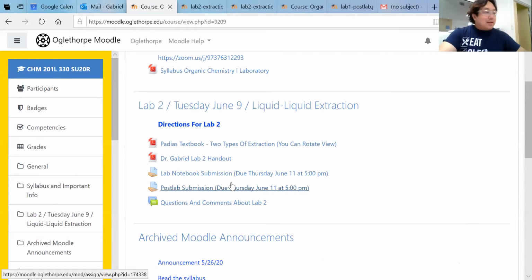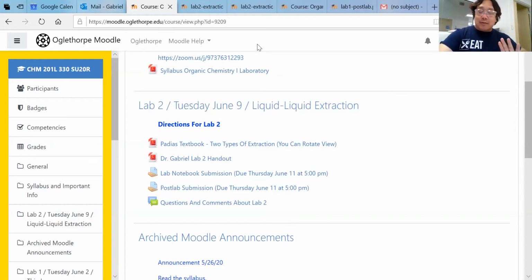Okay. Let me get to the setup and show you or demonstrate how to do an extraction. Again, you are taking observational notes, but you can definitely pause the video or rewind it. When I grade your lab notebook submission, I am looking for the pre-lab entry and your observational notes. How detailed are you? Let me give you an example. Something looks like water, okay? You could describe that as a clear liquid, okay? But that's not good enough.